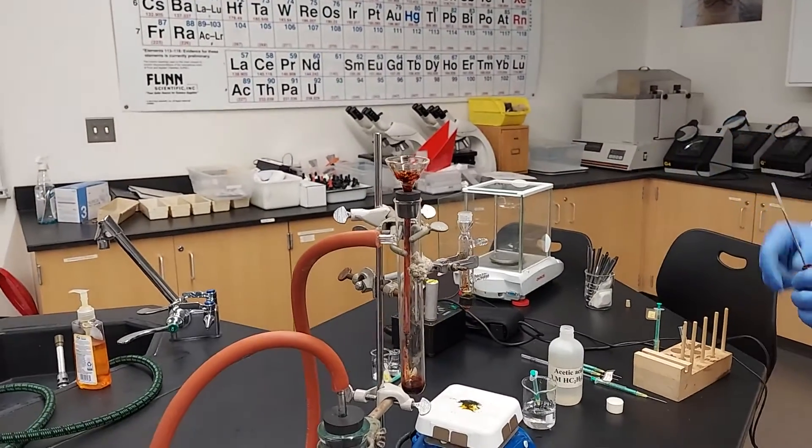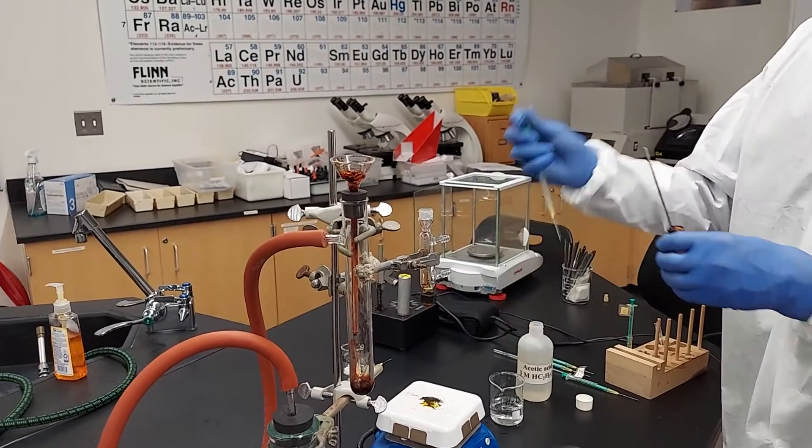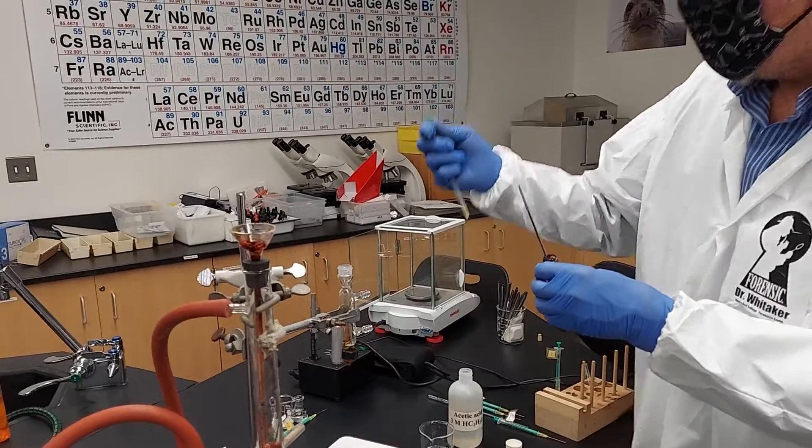Half a mil rinse there, and then another half a mil of water.